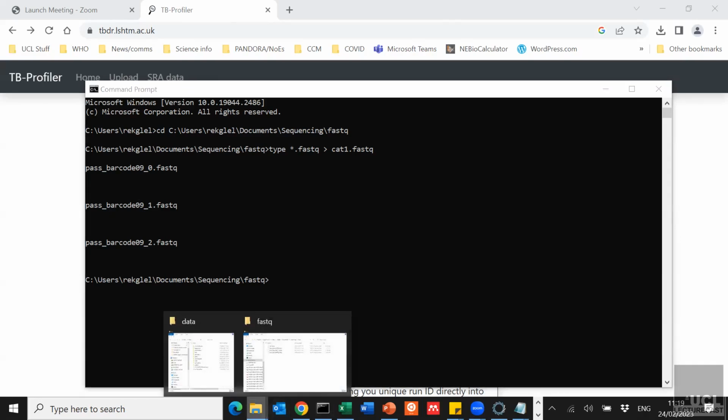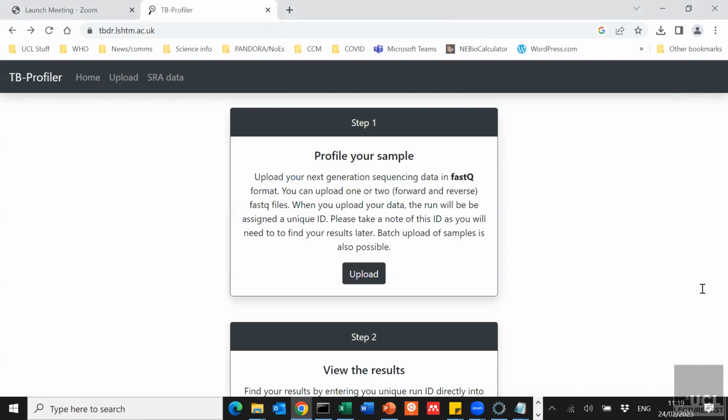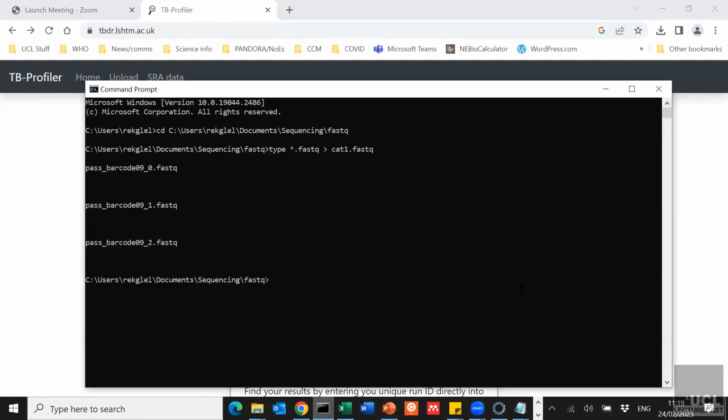Or will I have deleted it all because I tried to make space? I think I might have deleted it all. But what it'll give you is a folder called results, and then it will give you like BAM and JSON, and depending on what you ask it to output, it will give you all of those parts. So that is one of the advantages of the line command one, to get those intermediate versions, which is what's really useful.